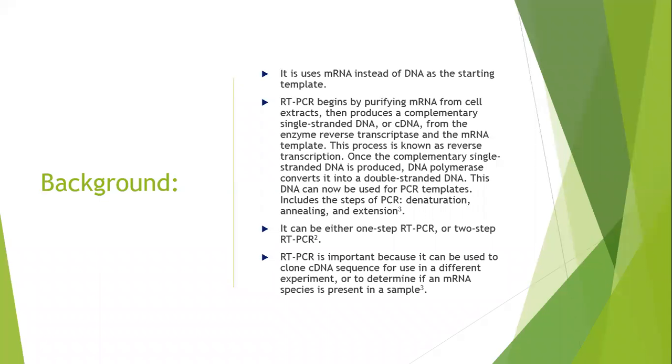So, RT-PCR is different from standard PCR because it uses mRNA instead of DNA as the starting template. The technique starts off with a sample of mRNA, and this mRNA is purified so that there aren't any contaminants.